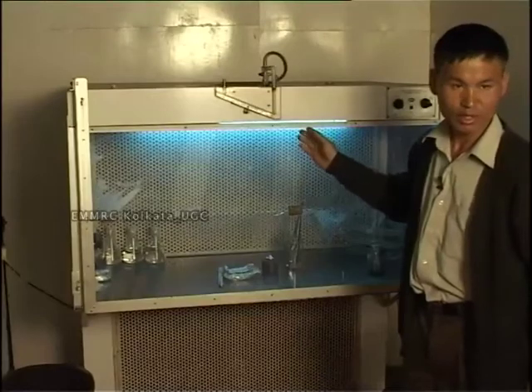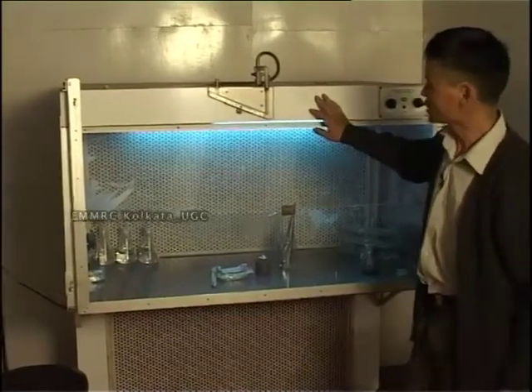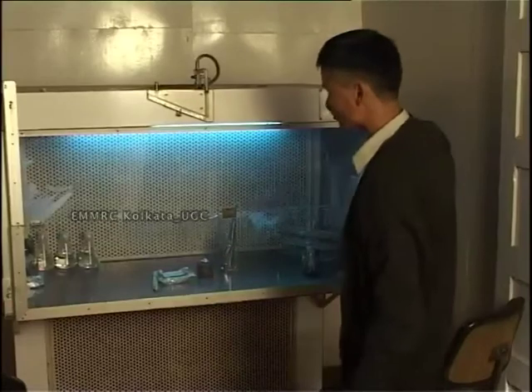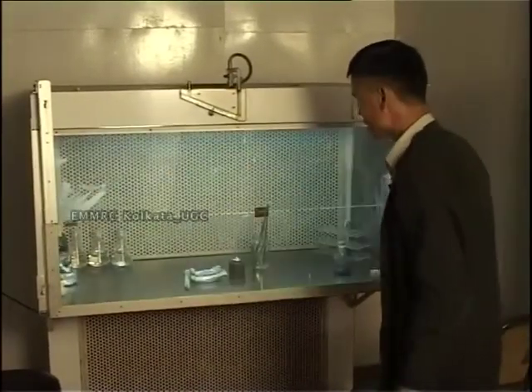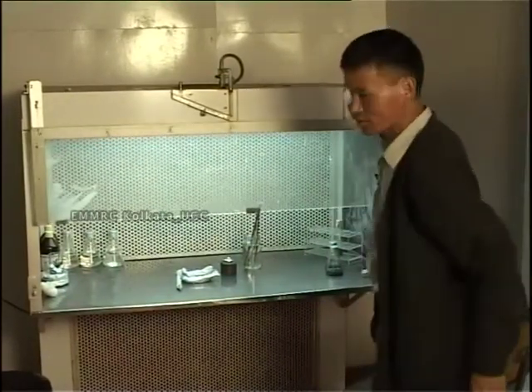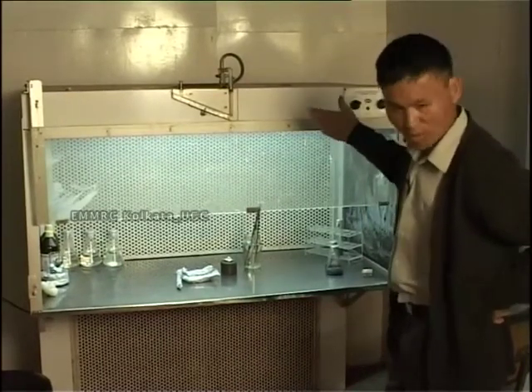Then the ultraviolet light is switched on and kept here for about 1 hour. It is advisable to keep it for about 1 hour. After that, before you come to work, you switch off the UV light. You can switch on the fluorescent light, but you still have to keep the blower on. This is how it works.